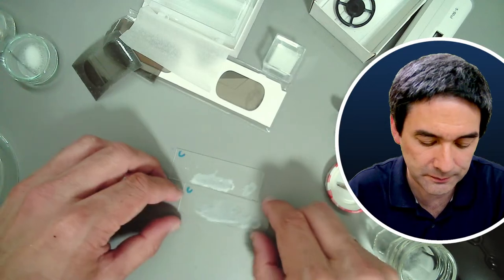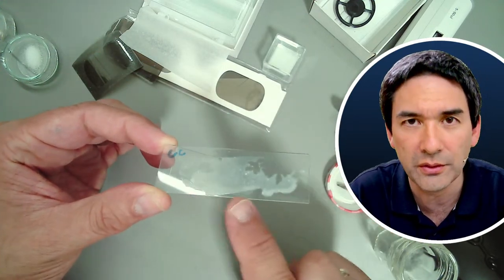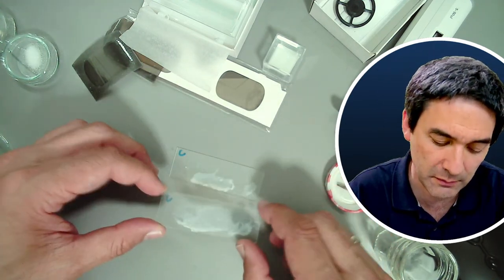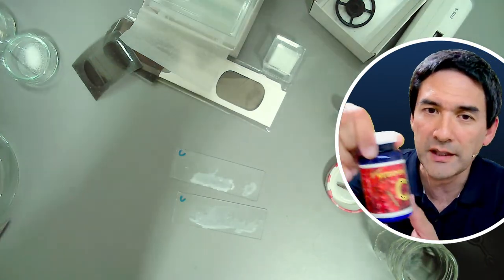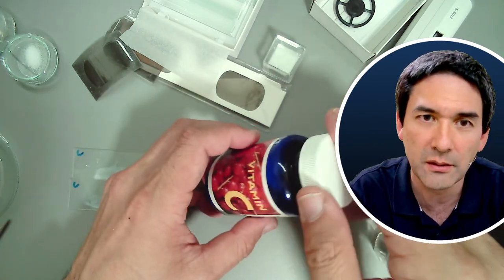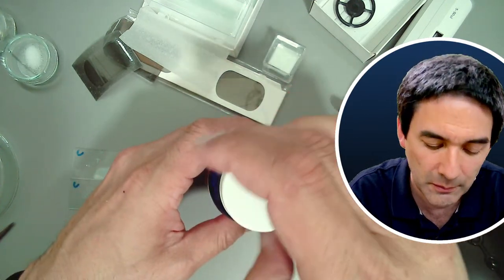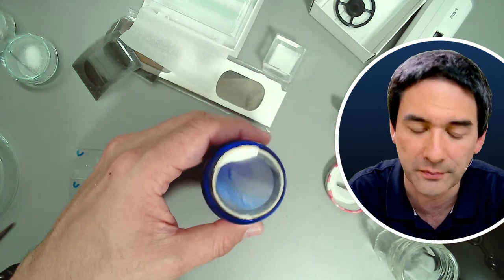If you look here, you see that there's this white thing on the slide. This is vitamin C. How does this actually work? It's like this. I bought myself some time ago pure vitamin C powder, and I bought this in a drugstore. When I say pure, it means it's not pressed in tablets, but it's in a pure crystalline form. So it looks like sugar or salt.